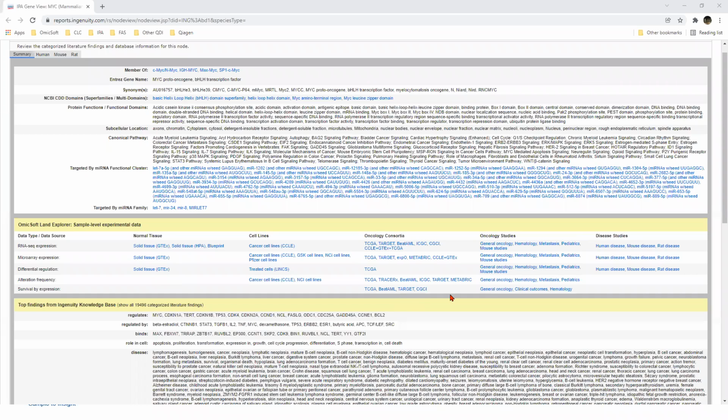So you can do this cross comparison by looking at this huge collection and just searching for your favorite gene and filtering for, let's say, tissue type or disease type, etc. I hope that answered your question when it came to the sources where IP is getting its data. Okay, thank you so much.